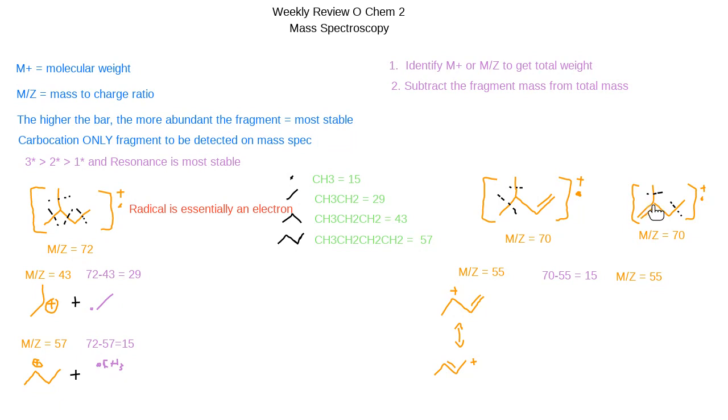This time we have a carbocation placed right here and a carbocation placed right here. Okay. Now, the carbocation placed right here would be a primary, but the carbocation placed right here would be secondary. But if you remember from OChem 1, Unit 2, placing a carbocation right here on top of a double bond, we call that something that starts with a V. Right, it's vinylic. Perfect. Okay, so that is why this is not the ideal cleavage. We are going to cleave right here.